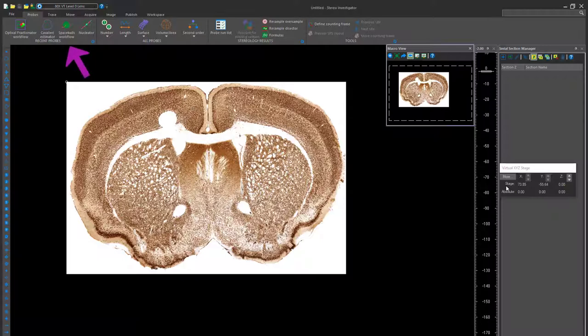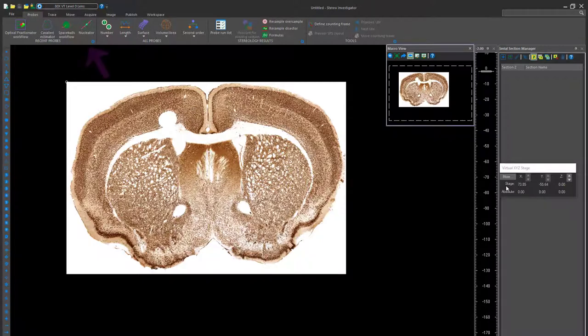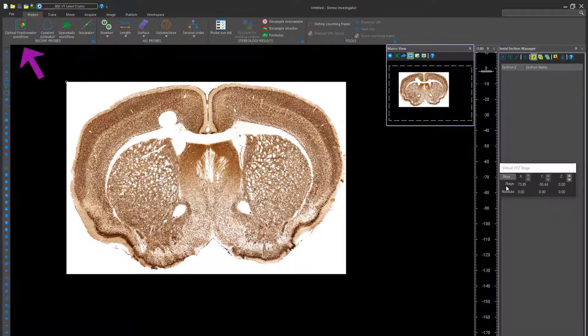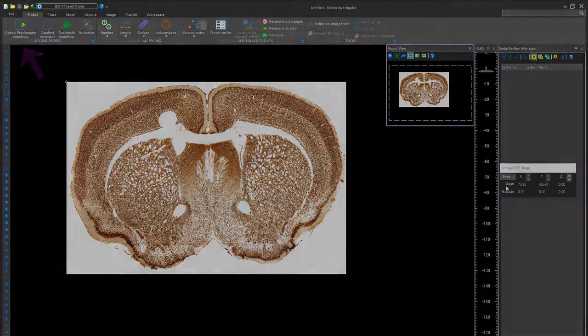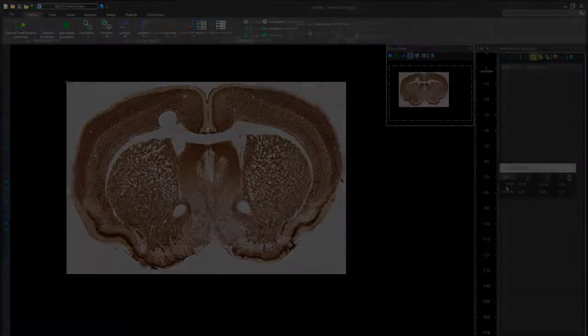The Spaceball workflow allows you to see estimates of length of biological strings, such as blood vessels or axons. The Nucleator allows you to estimate cell volume, and the Optical Fractionator workflow allows the researcher to estimate the number of cells within the tissue.